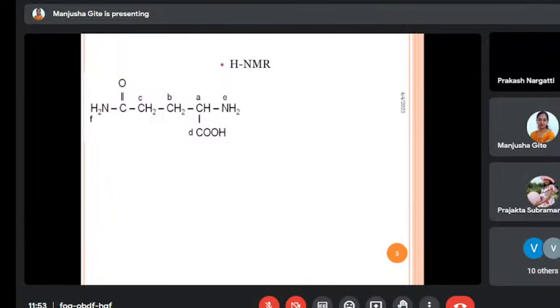Existing two isomers A and B. Yes, sir. One of them gives an IR absorption peak at 1050 cm inverse. And the second hint: its M+ peak is at 46 and one peak at 31 and 15. Which is it?